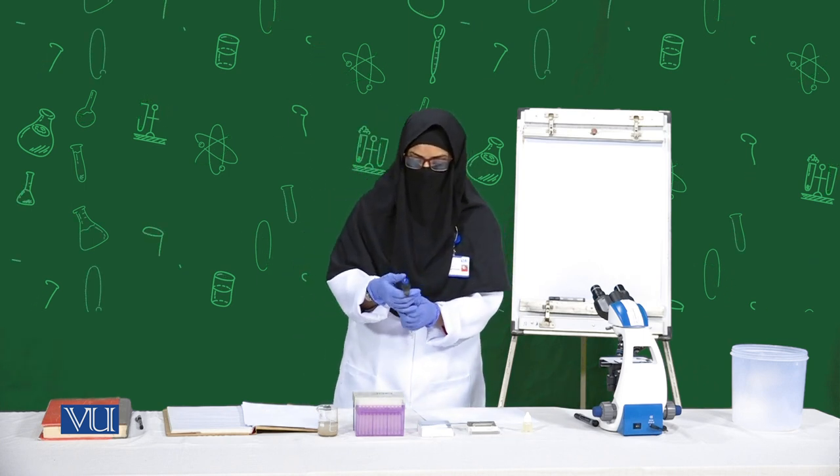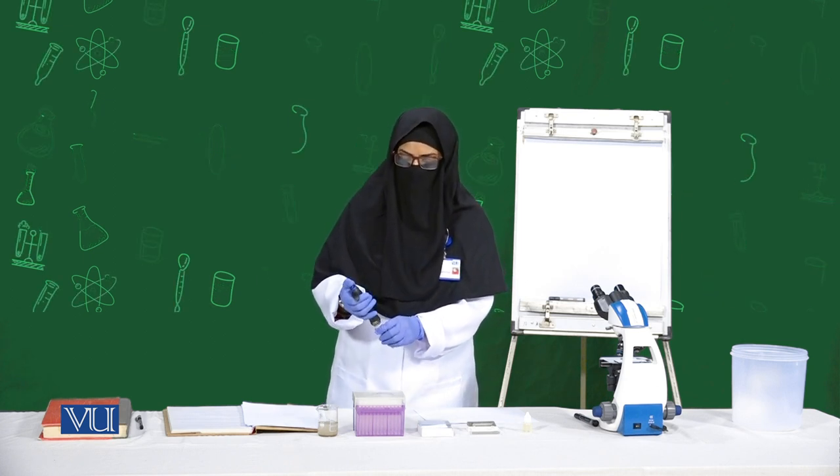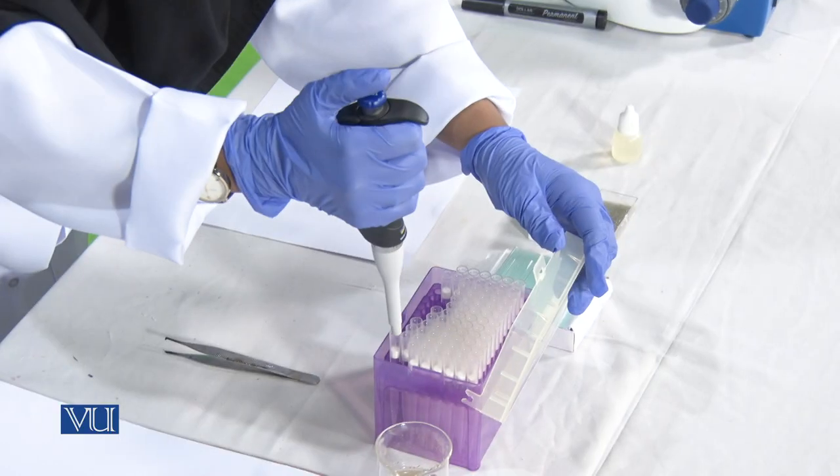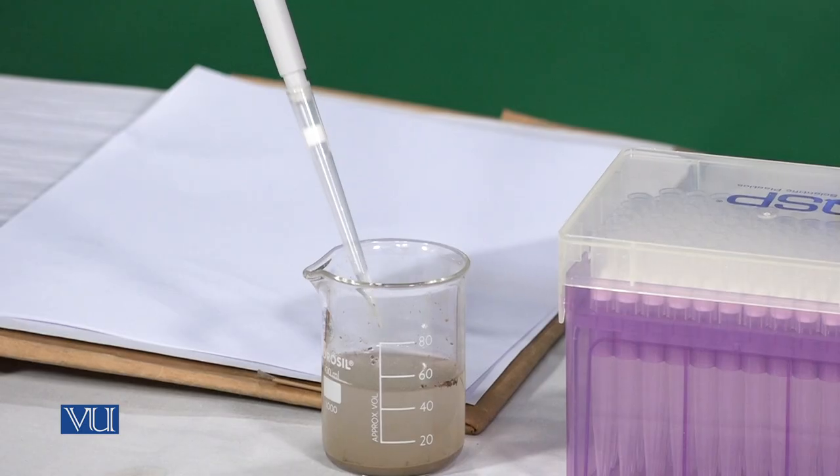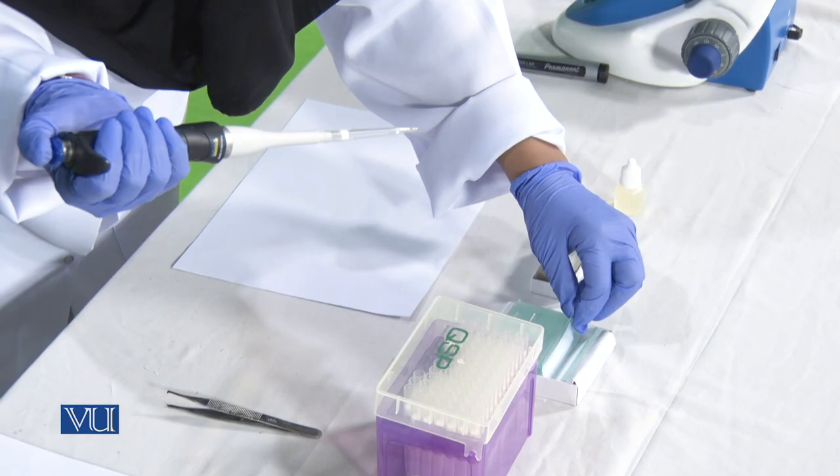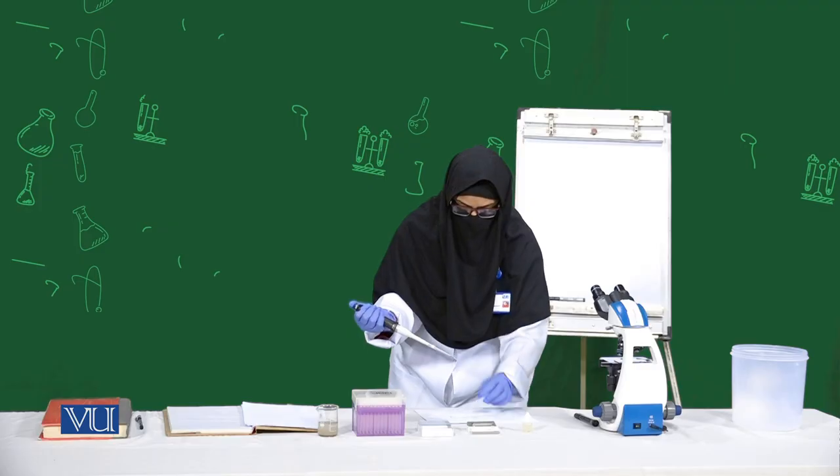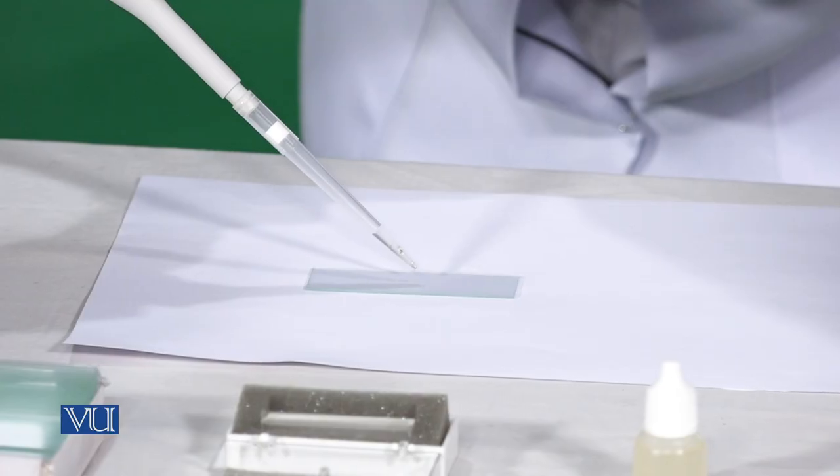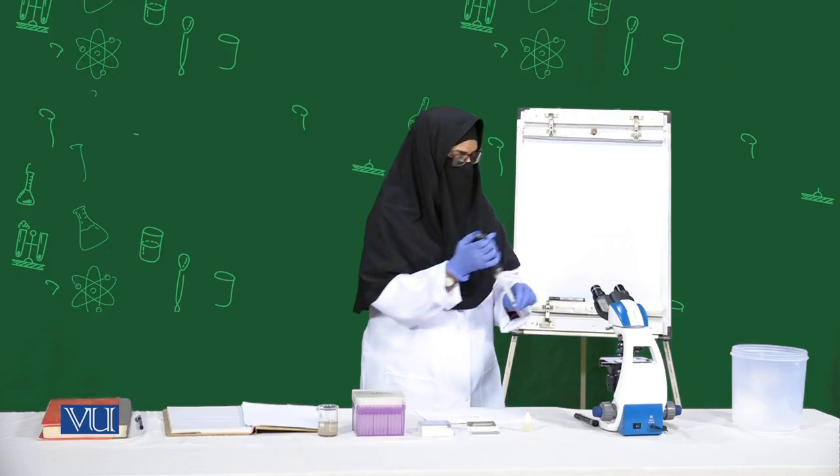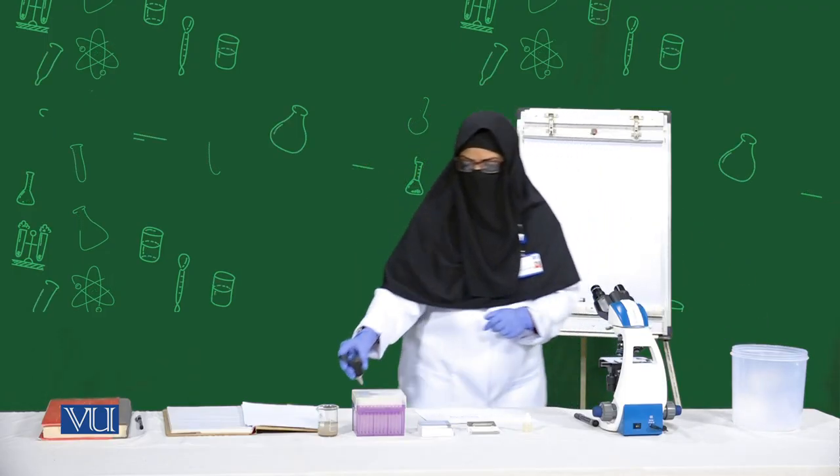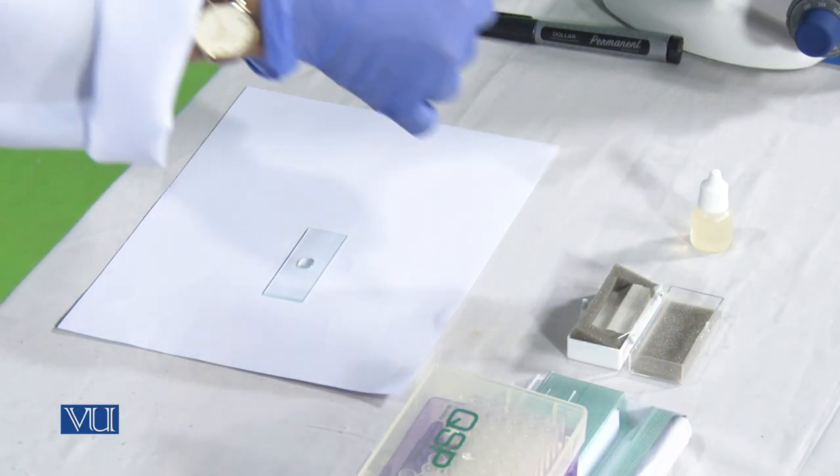I have set the pipette for proper measurement at 100 microliters. I will take 100 microliters of pond water on a clear slide, put the water, and discard the tip. Then we'll cover it with the cover slip.